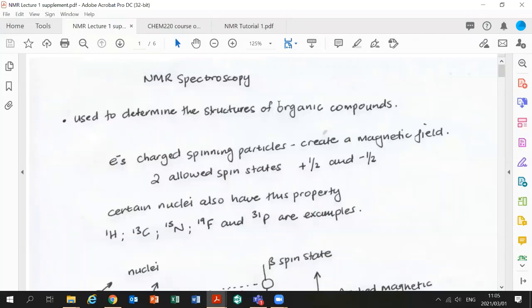Generally, in the course of your careers or in your time as students, you're going to make certain compounds. And when you make certain compounds, you might want to know if you did make it. Did I set out to make what I made? If you're going to bake a cake, you wait to taste the first piece of cake, and if the cake tastes sour, you know that it's not generally a cake. Maybe you made something else. If the cake tastes nice and sweet and sugary, and it has a nice texture, you say, okay, I did make my cake.